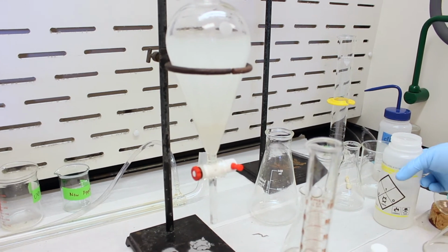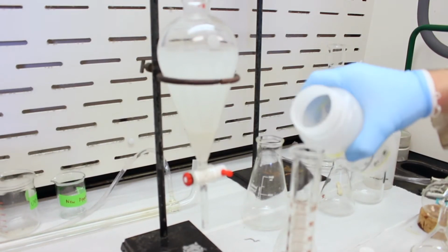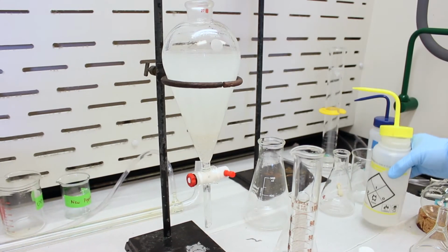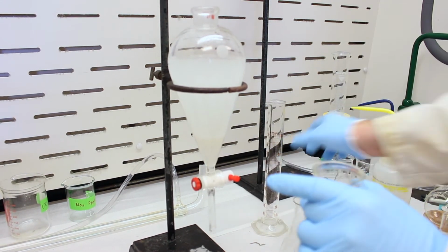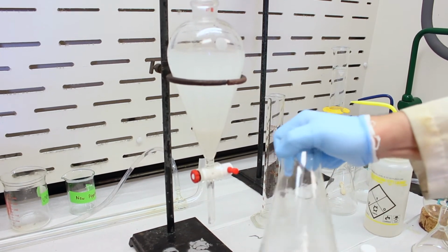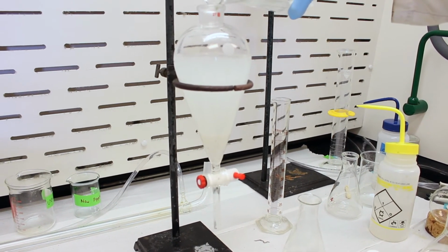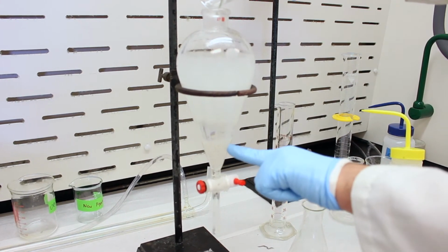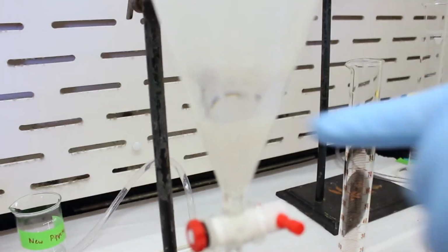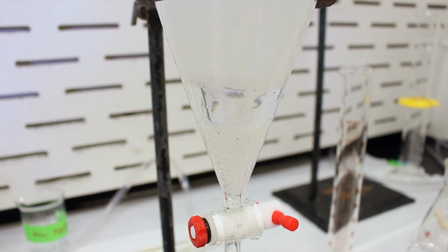So maybe we'll add a little more DCM this time. Let's add maybe closer to 50 mils. That might form the layer a little bit better. And once again, we can rinse out the flask which contained the distillate, try to get all the eugenol out. Yeah, and you can see that the layers have kind of separated out a little bit now that I've added more DCM. So what I'll do is I'll try to shake it a little more gingerly this time so as not to emulsify it.